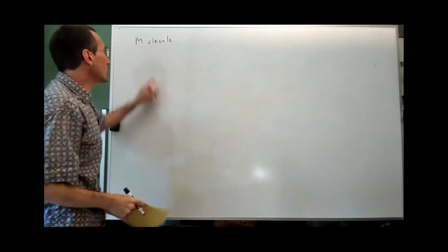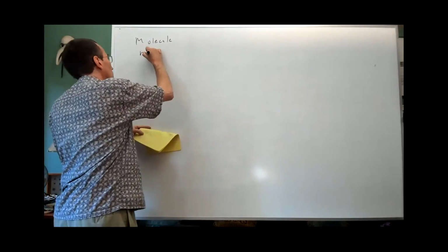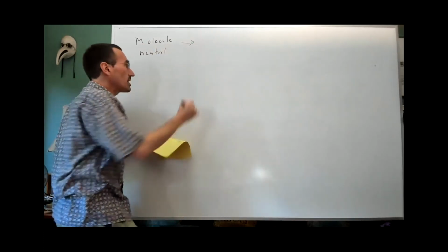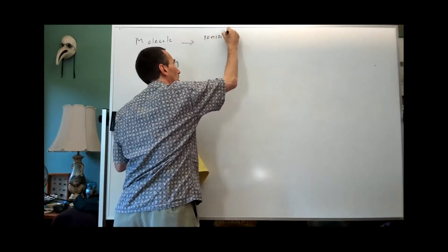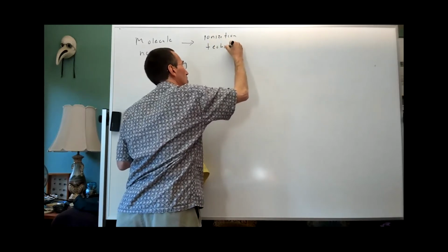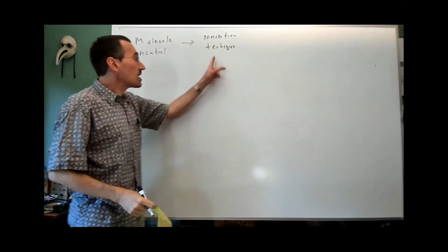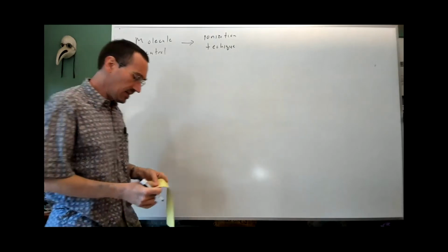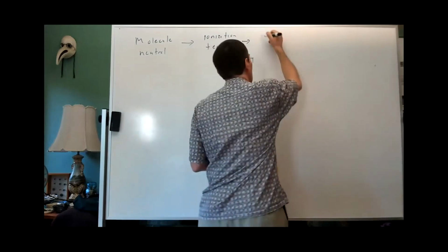So most organic molecules are going to be neutral. So the first thing that you need is to get a charge on the molecule through some ionization technique, and get the molecule into the gas phase, usually at the same time. Then we need some sort of analysis technique.